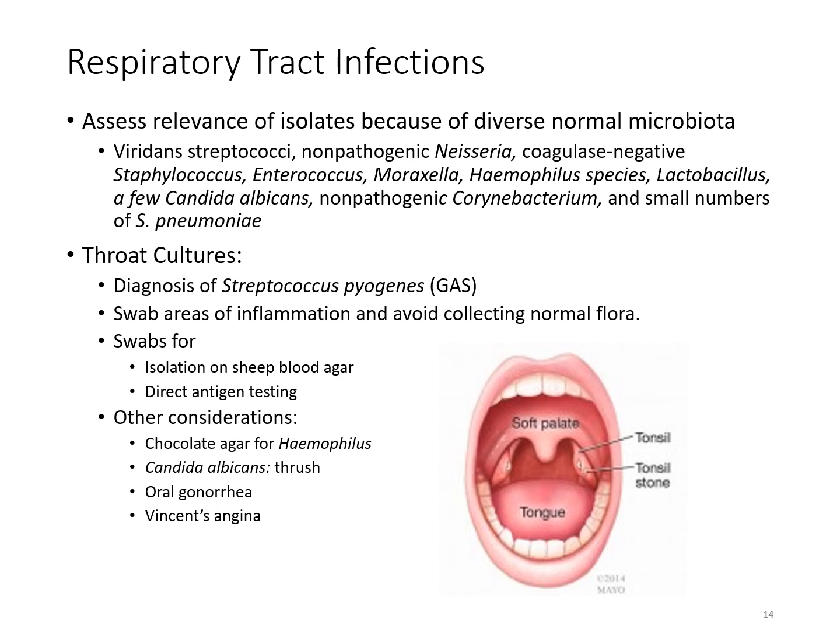Swabs are going to be used to isolate that specimen on blood agar, and remember that with our blood agar, we're going to be looking for the result of that hemolysis in that agar. So this is where the hemolysis comes into play when we're doing throat cultures and looking for a particular hemolysis pattern to be present. We're going to talk about that in more detail when we talk about Strep pyogenes.